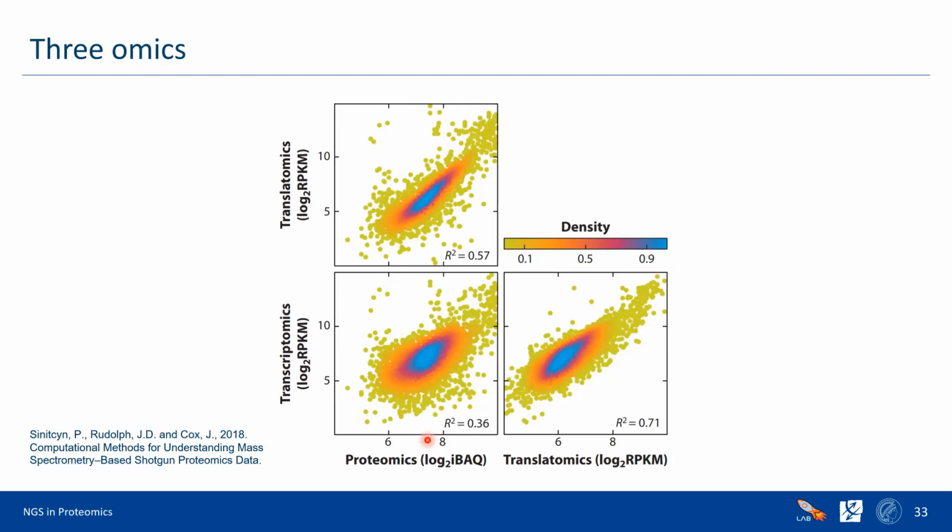We have proteomics data, and we see iBAQ. iBAQ is really the proteomics alternative to genomics RPKM, transcriptomics RPKM, which is why it's used here. They're very well comparable, so we compare iBAQ versus RPKM, which is just the normalized value of the transcription expression.